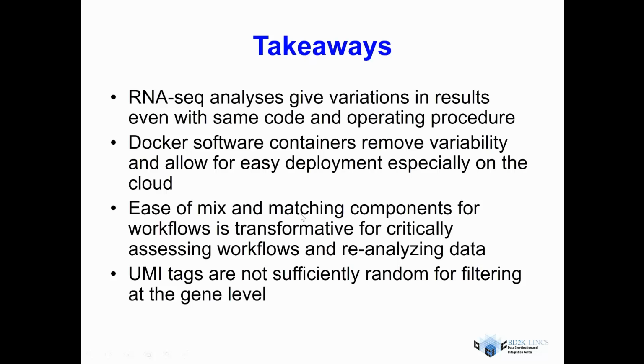I think one of the things which I hope to get across is that the ease of mix matching components or workflows because of Docker will be transformative. I think this will allow people to reproduce and quickly analyze workflows and reanalyze data. And things like this UMI tag, these little artifacts, will pop up when we allow people to do that type of digging.